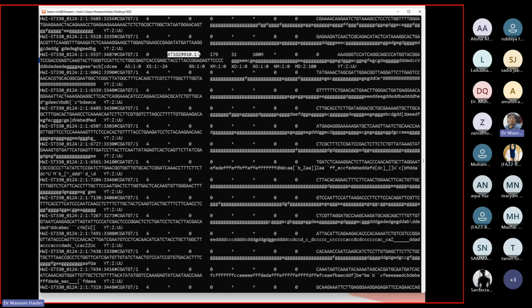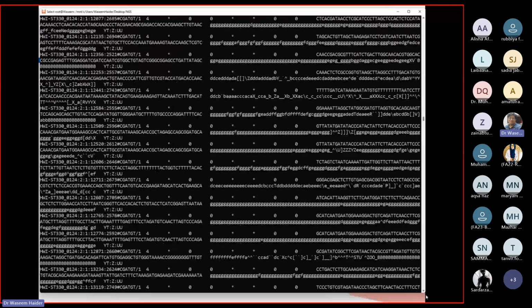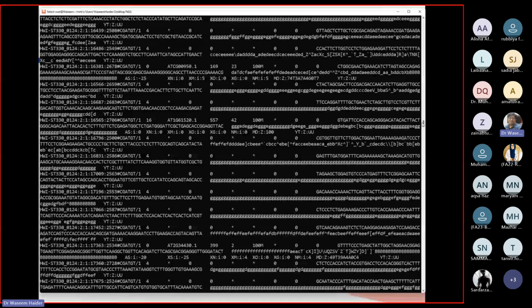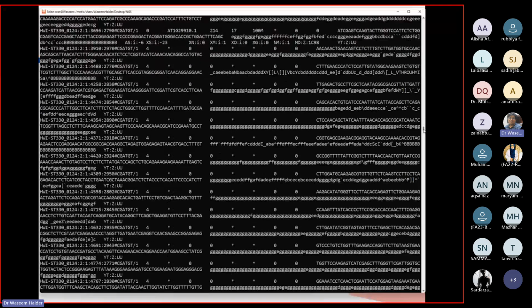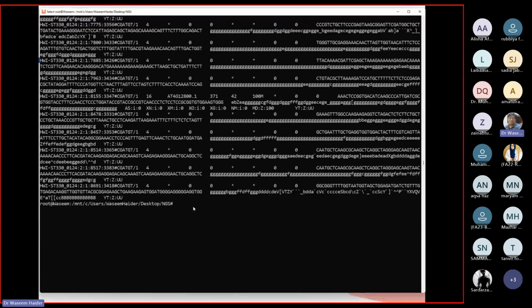But I cannot do anything with this output unless I store it, right? In order to store that, there is one simple way of doing it. We can see this output is also that big, so it has taken much of my terminal, and it's really hard to find anything. That's why we do this head and tail thing, right? So again I press the up arrow key, and now I just add the right arrow.